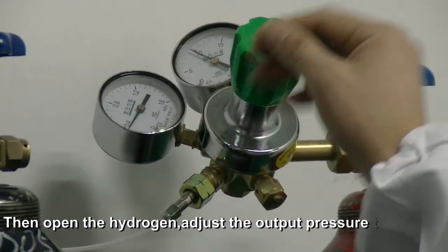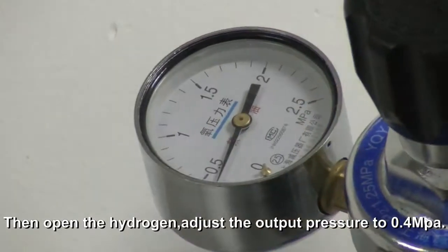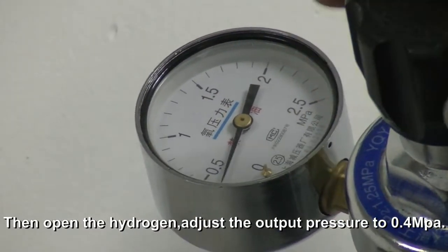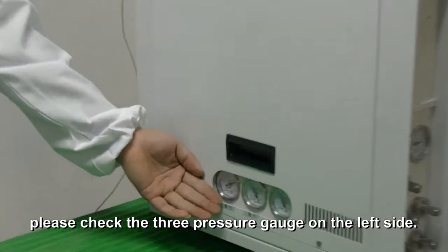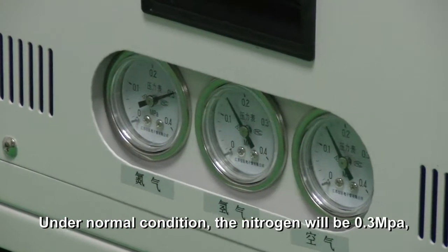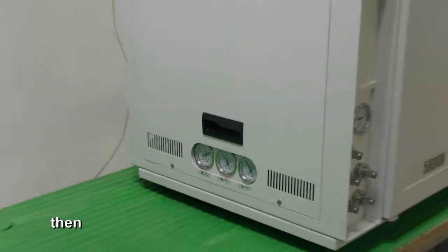After opening the gas, check the three-pressure gauge on the left side. Under normal conditions, the nitrogen will be 0.3 MPa, hydrogen and air will be 0.15 MPa. This means the gas path is connected correctly.